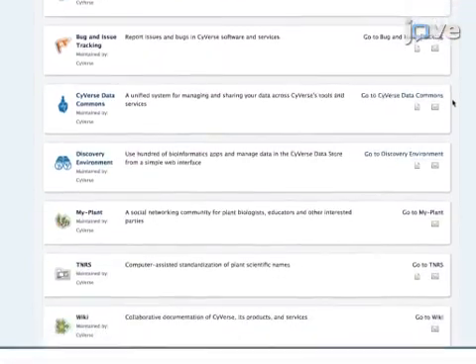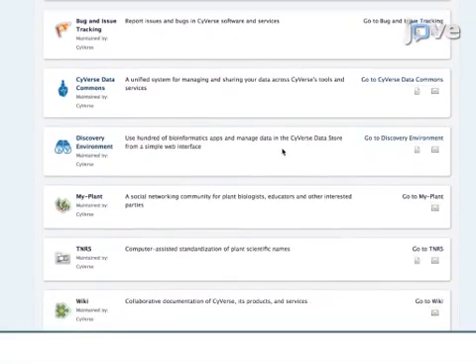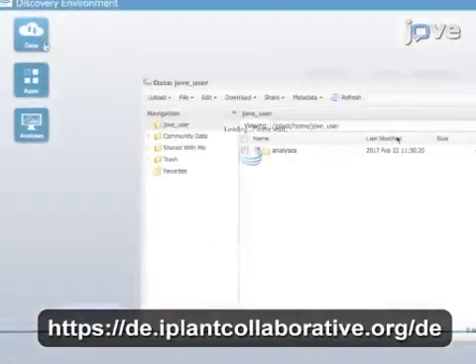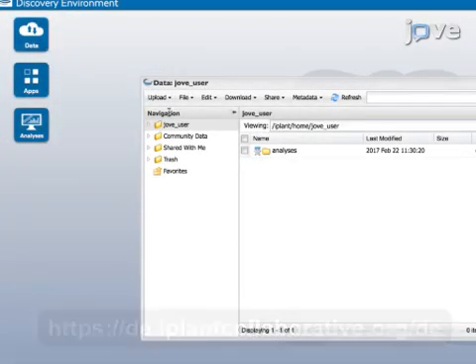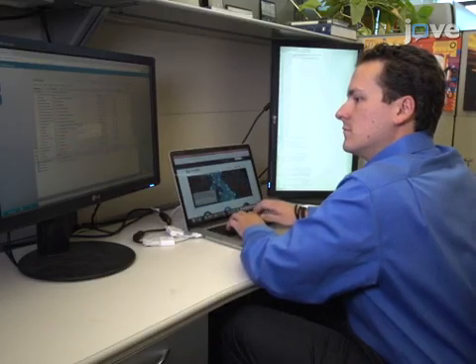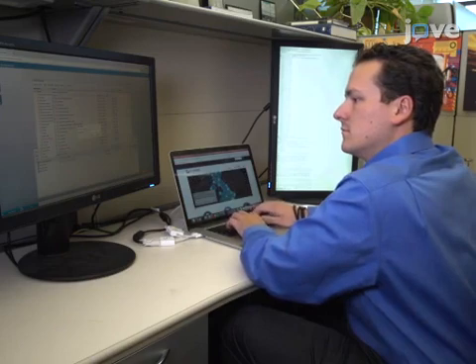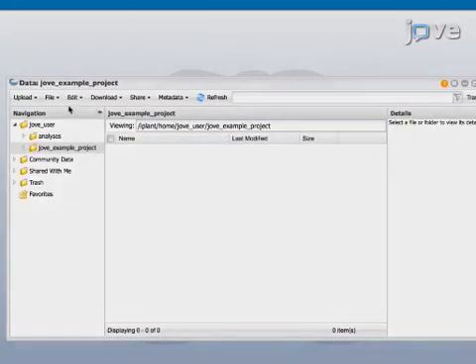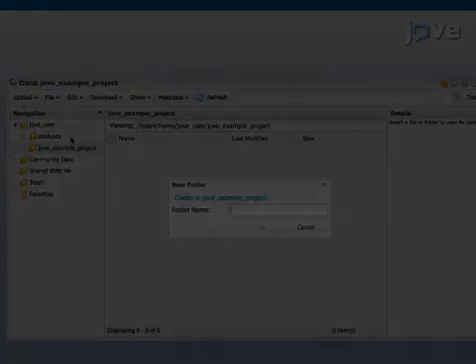Login to the Discovery Environment, abbreviated as DE. Then select the data tab to bring up a menu containing all the folders in the data store. Create a main project folder that will house all of the data associated with the project. Find the toolbar at the top of the data window and select File > New Folder.